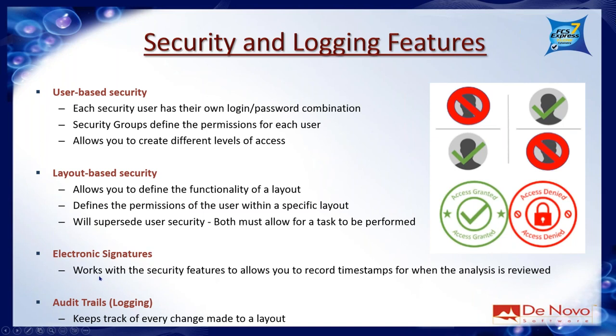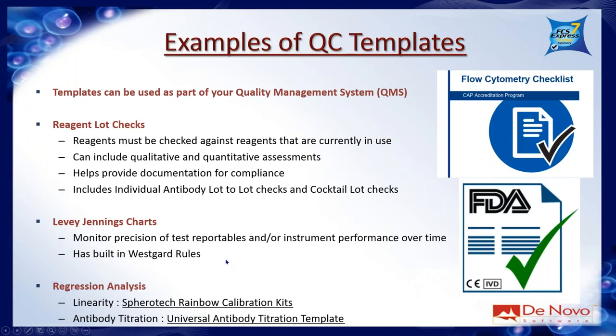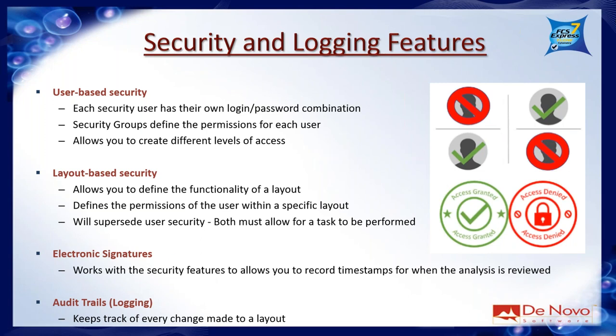Within security, we have the ability to add electronic signatures, which works with those security features to record timestamps for when the analysis is reviewed or signed off. For audit trails, you have the ability to keep track of every change made to a layout from when it's opened to when it's saved. This includes moving a gate, changing quadrants, or electronically signing. It documents what the change was, which user made it, and the date and time. If you move a gate, it tells you exactly which plot, where it was moved to, and what was changed.